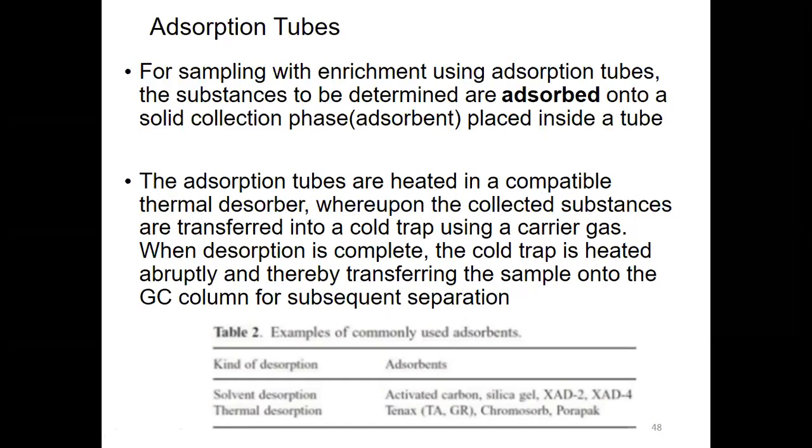Then we can use this gas for the analysis, right? So here it describes thermal desorption, and there's another way, solvent desorption. See, this table shows the commonly used adsorbents and the type of desorption available. So the first one is the solvent desorption and the thermal desorption.